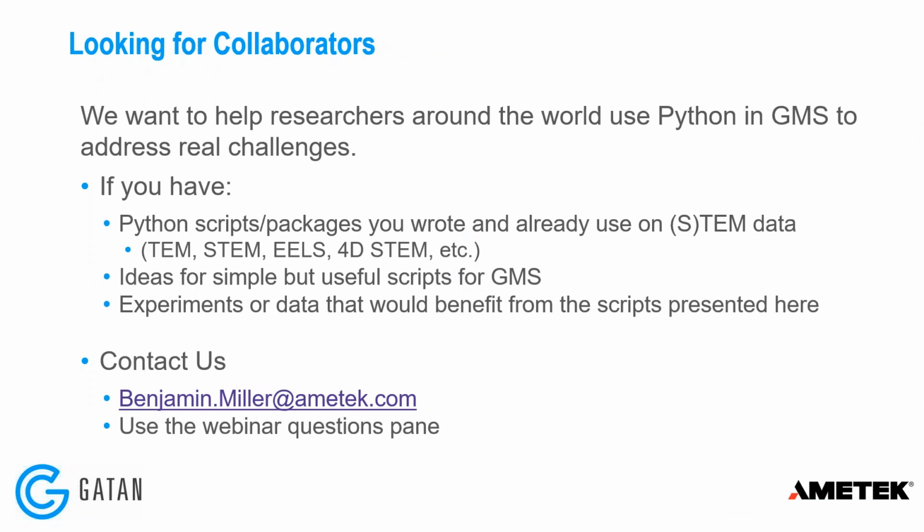Finally, we're really looking for collaborators. We want to help researchers around the world to get started using Python in GMS to address real challenges that you have.